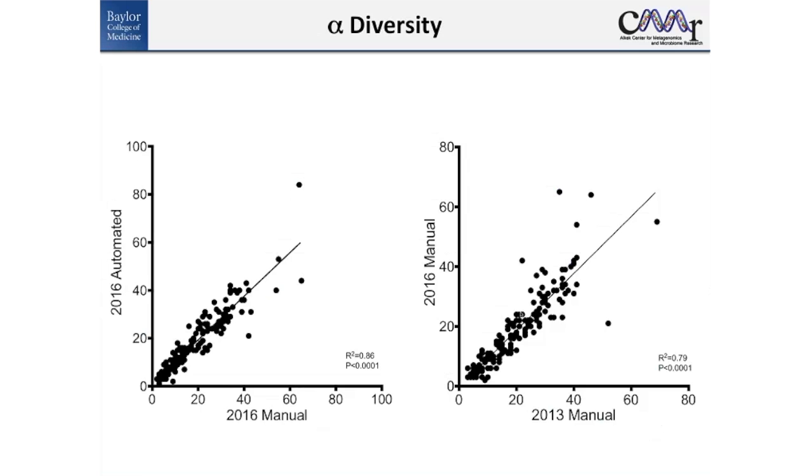And so this is how we see validation. This doesn't mean it's either the right answer or the only answer, so I'm always open to other suggestions. I gave a talk at NIST about a month ago, and so we got lots of good feedback there. We're working with our bioinformaticians to kind of tease out what is the best way to evaluate the question that we want to ask, and that is, do we get the same answer each time that we run this? Because regulatory agencies want to see that if 5 years from now I come back, can we run the same samples and get the same answer? And so you need a version control on your software, which we do, because it does change. It's a pretty dynamic field and things are changing all the time. But we're very careful to timestamp those so that if somebody came in and wanted to repeat the study, we could do that. That answers the question.